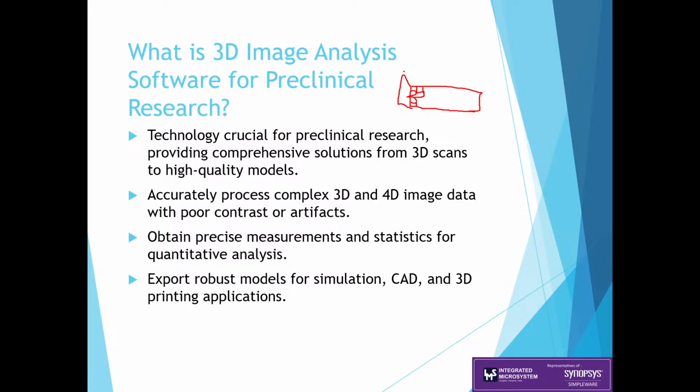Small blocks of cuboids form the voxel counts of the particular image that we need to work with in 3D. This way we can get an actual representation while we are analyzing the depth. This is of foremost importance when we need to do any sort of 3D image reconstruction. For that, what we deal with are slices, or a stack of images, in general terms.